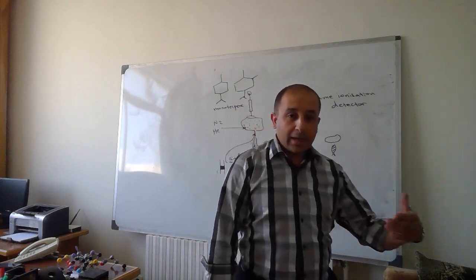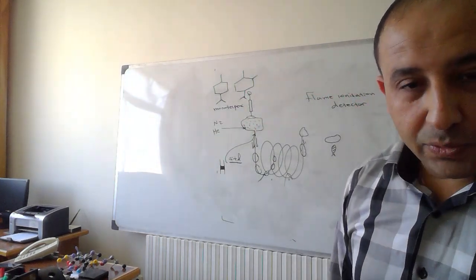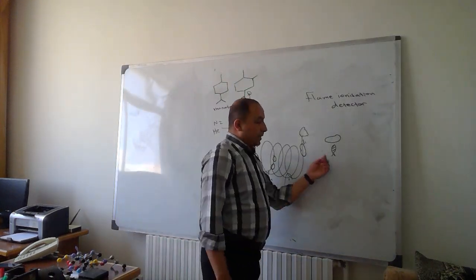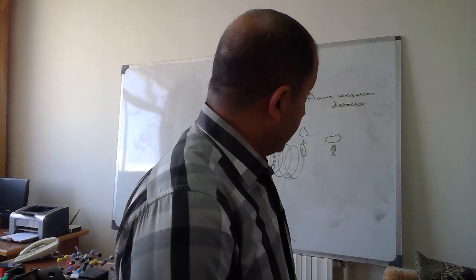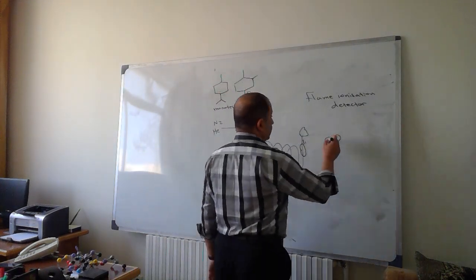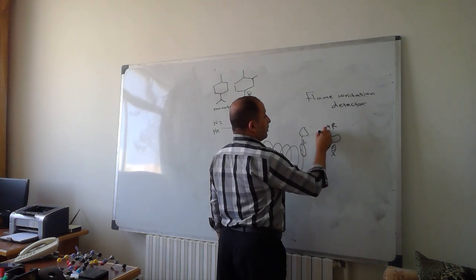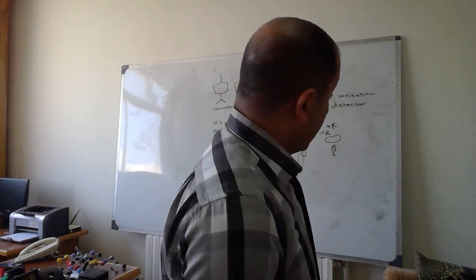That's why we have oxygen and hydrogen as well, to support and to fuel the flame. The flame will give us compounds, negatives and positives.